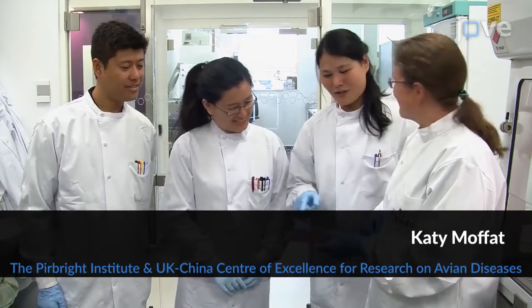Demonstrating the procedure will be Katie Muffet, an expert in cell sorting, Na Tang, Yao Yao Zhang and Guang Guangqiu, scientists from my laboratory.